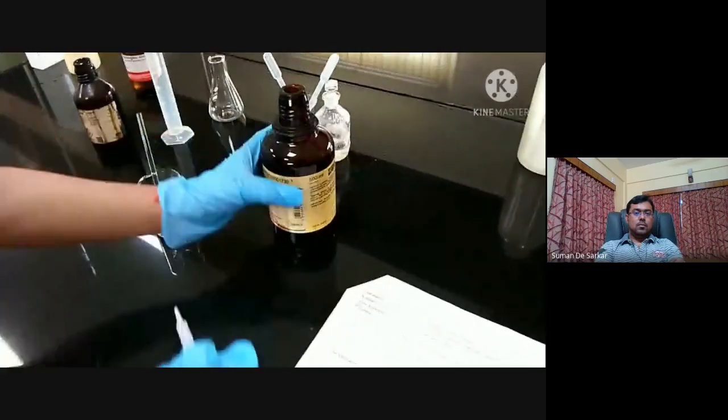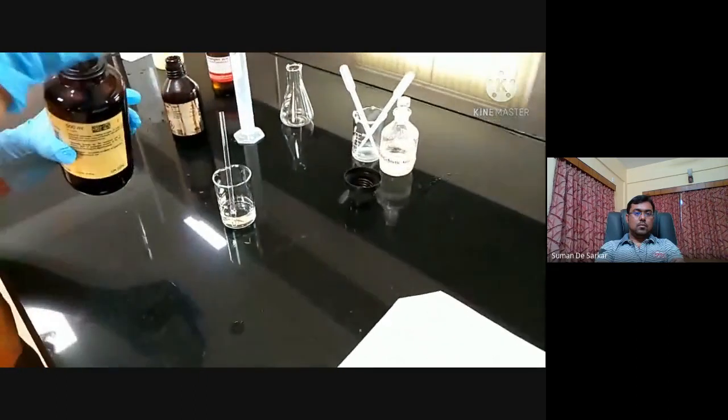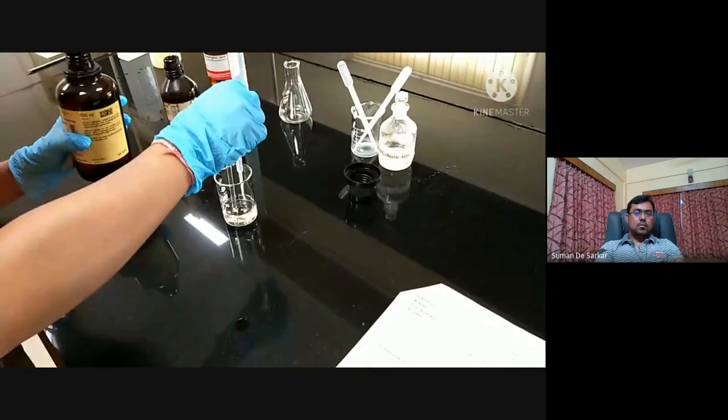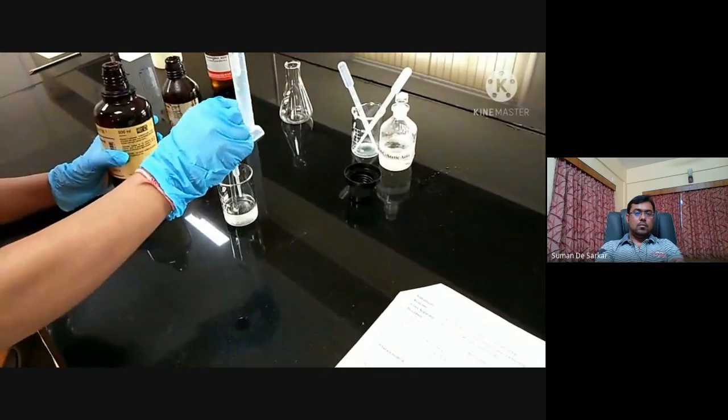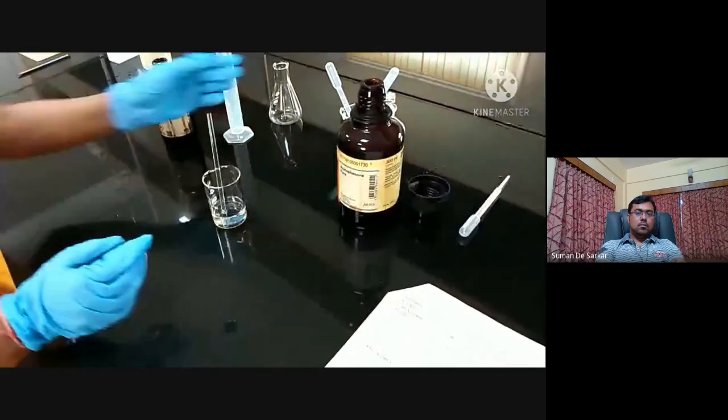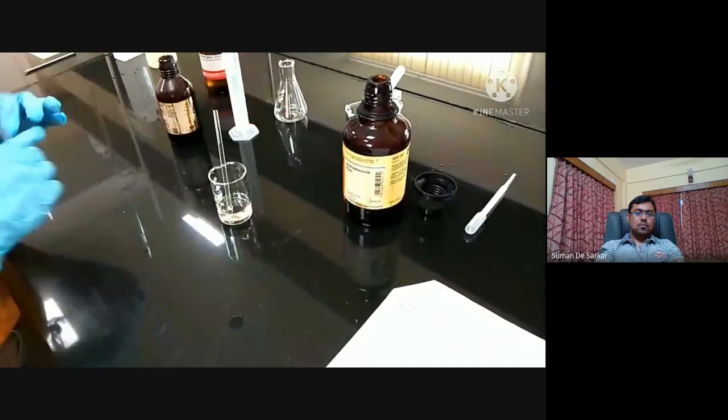Now we are going to add the acetophenone to the ethanol. Required amount is 1 gram. Both are liquid, so it dissolved easily. Now we have the solution of acetophenone in ethanol.